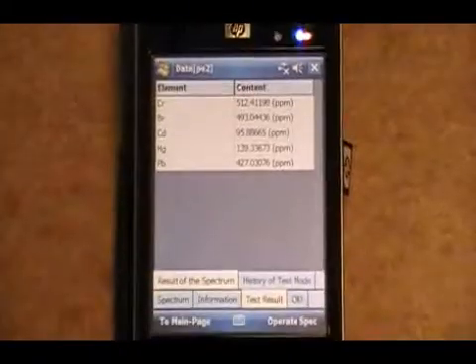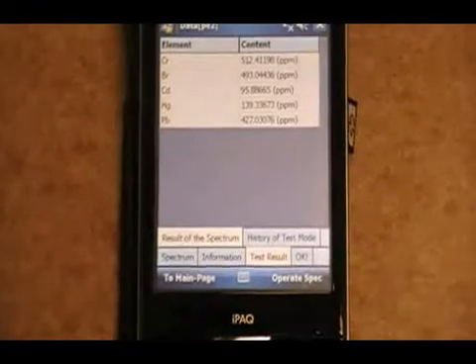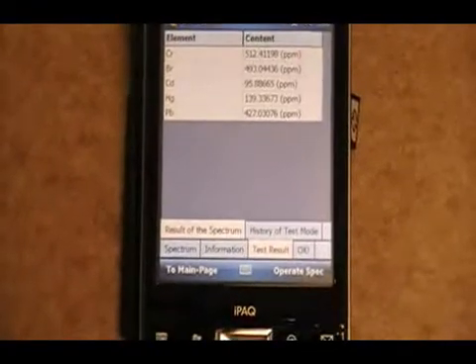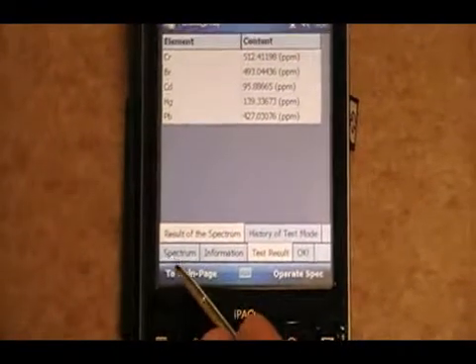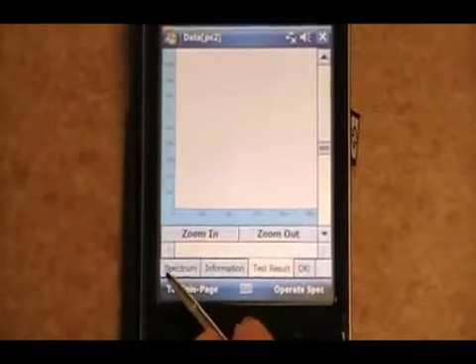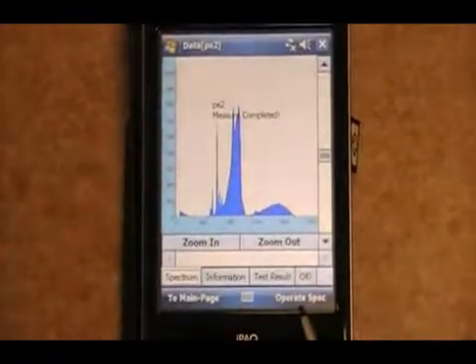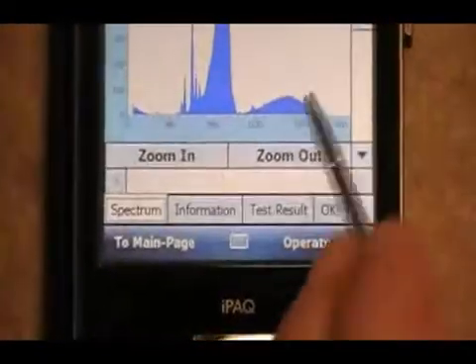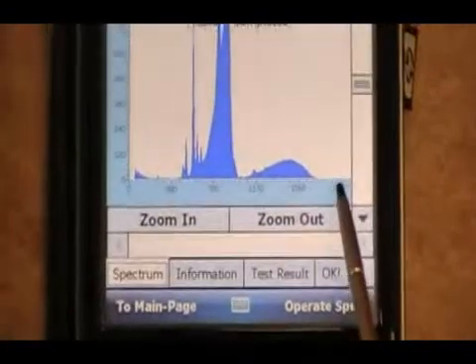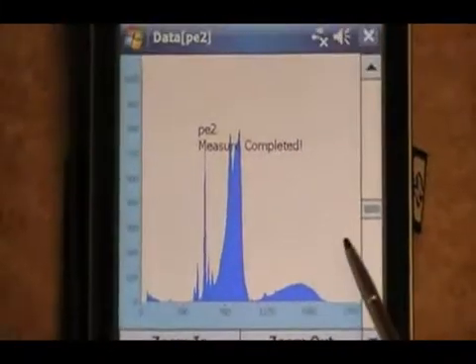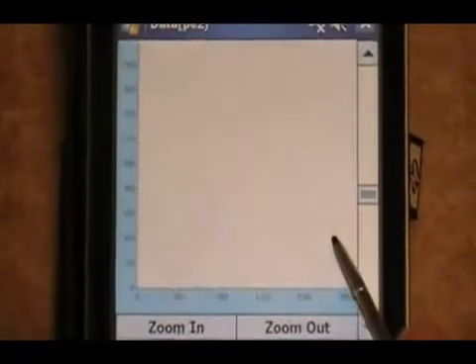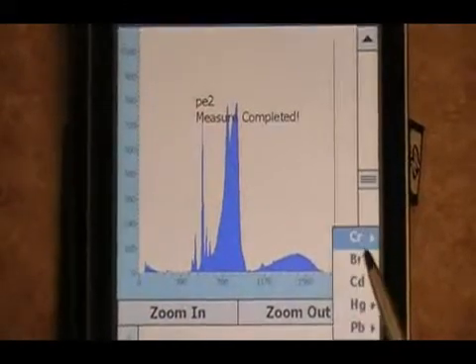Once the unit says OK after the 40 seconds, you can move on. At this point, however, before I move to the next screen and do one more run, as you can see, this is the spectrum. It says PE2, measure completed. By pressing and holding on the screen and letting go.